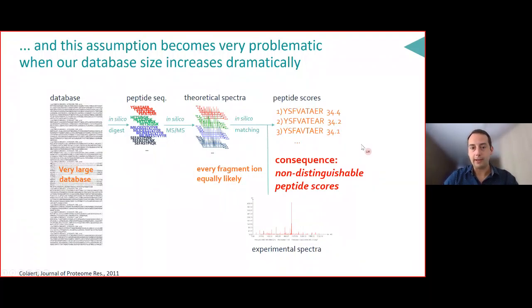And this is really problematic because, of course, everybody wants to get some proteogenomics information, wants to do metaproteomics, wants to do open modification searches, because we know there's a lot of information there that we're currently not seeing because of the limits set upon us by our database addiction. So the rest of the talk will be about how we circumvent that, and what we do with the results once we've managed to circumvent that.